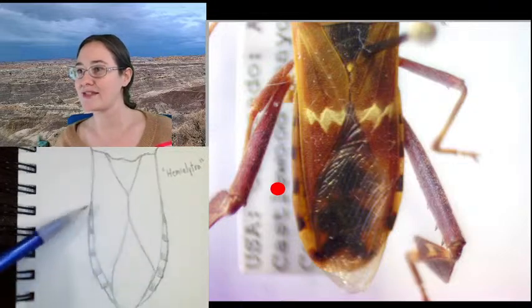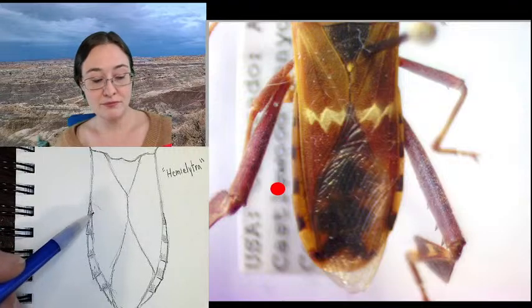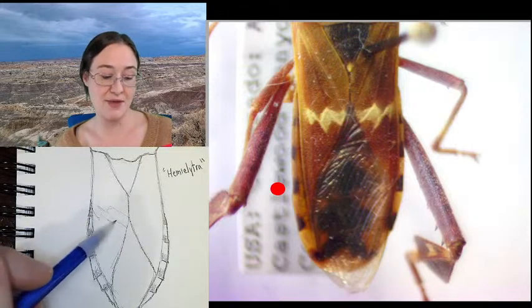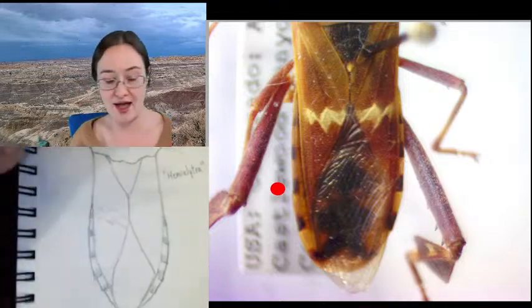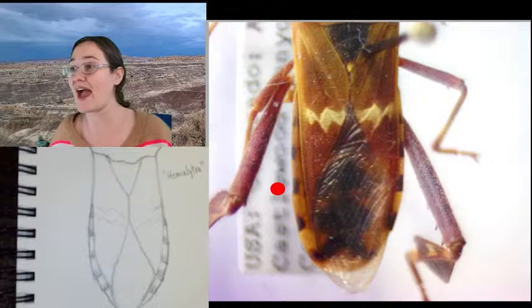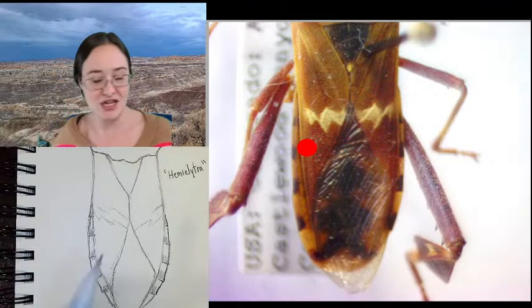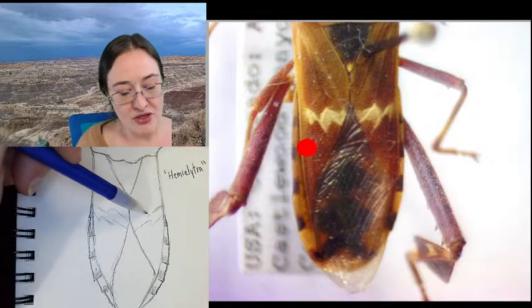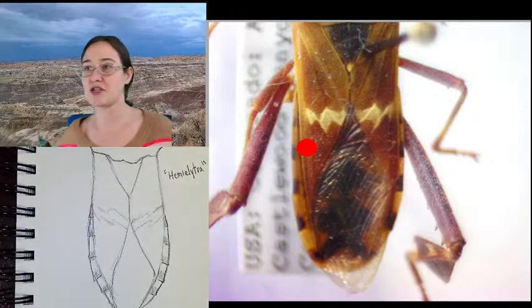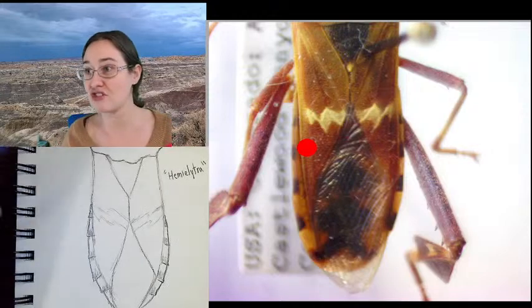I think I want to get this line across the center taken care of. There is some variety in this horizontal light line across the hemielytra. So when we're sketching it, it's okay if this one is not as. So you'll notice the left side isn't all the way symmetrical to the right side. There's a little bit of differences. As long as we're staying pretty similar, there's also a large variety in just the species in general. So you've got this line, but sometimes it's a little wider, sometimes it's a little thinner. These guys can be lighter or darker, just depending on their genetics, essentially.